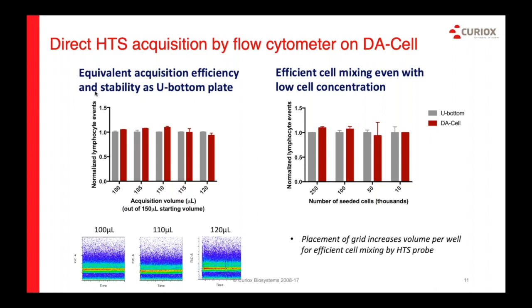And often a flow cytometer, depending on its behavior, how it aspirates the cells up into the fluidic system, might require 100 to 150 microliters of starting fluid. So we do have an accessory to increase the volume of the plate when it's time to read. Now, for example, in this case, it's on an HTS plate reader on a Becton-Dickinson flow cytometer.